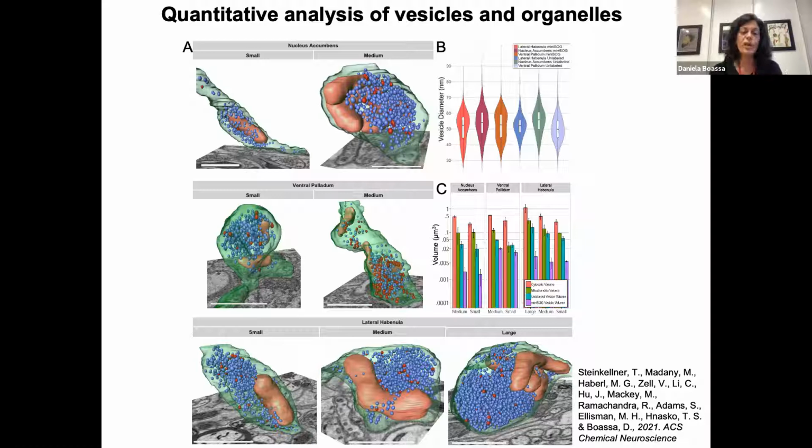So in summary, the capability to combine genetic EM probes and correlative imaging approaches with 3D EM methods with sophisticated computational tools for image analysis has expanded our possibility to visualize biological specimens. And in the future, further development and enhancement will continue to push forward our comprehensive understanding of biological functions.